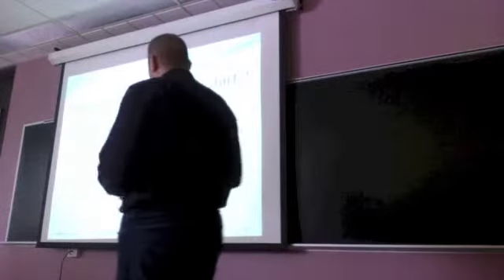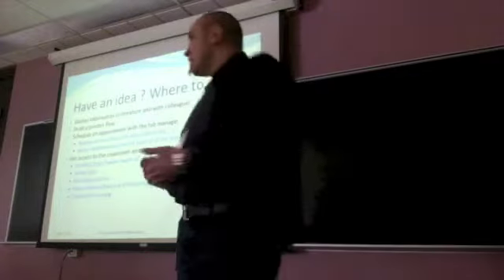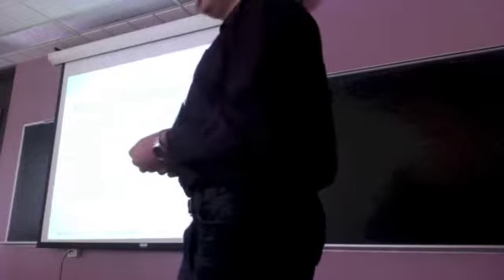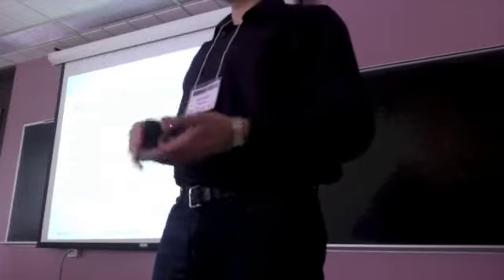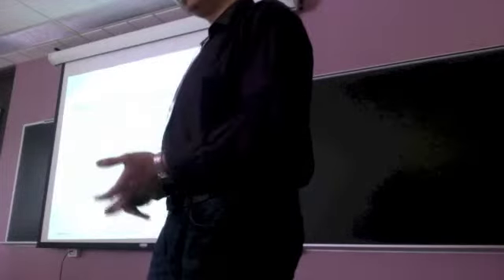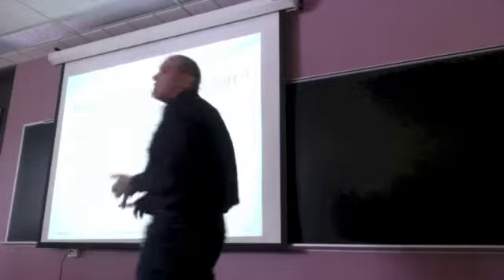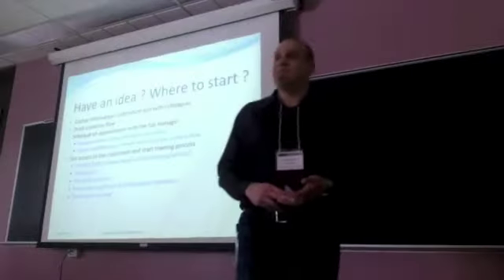To get access to the clean room, we have a procedure very well explained on our website, and some of the steps are getting your WHMIS certificate, because we use a lot of chemicals, gases, and dangerous products inside. So you need your WHMIS certificate to enter the clean rooms. You need to pass a safety quiz, and afterwards you need to know the microfab policies.